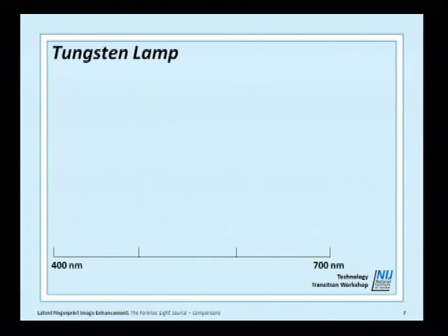So if we take a look at it in terms of the spectrum, we find that even though tungsten is considered a white light, there are white lights and then there are white lights. The thing that we are concerned with here, in terms of finding something appropriate for the technique, is more appropriately called color temperature. And that means the relative distribution of the wavelengths within that source.